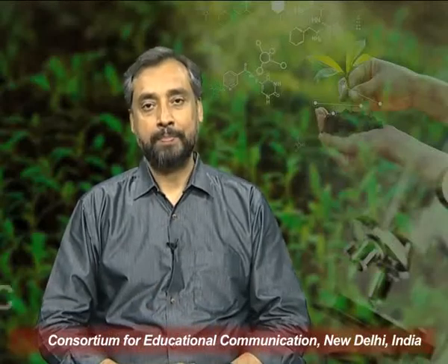In the previous lecture, we have understood and discussed the basic principles behind electron microscopy, the basic concepts of resolution, and the various types of electron microscopy, and especially the transmission electron microscopes.